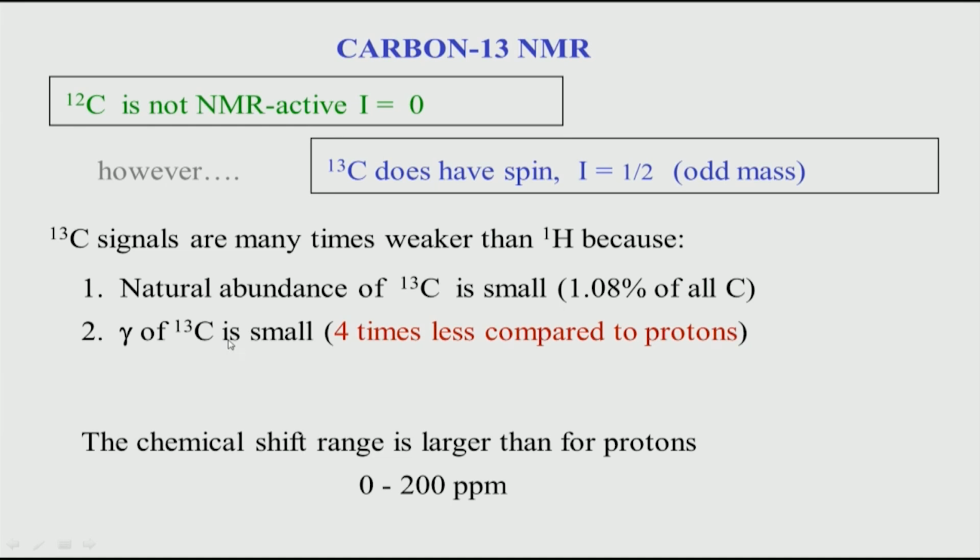But there is one more factor which makes carbon 13 even more insensitive, which is when we detect carbon. So normally what happens is in 1D NMR we apply the pulse to proton and we detect the proton signal. That is the standard 1D NMR, proton NMR which we have seen up to now. But if you do the same thing with carbon, we are going to excite or apply a pulse on carbon and also detect carbon. So during detection, again the sensitivity of the gamma comes into picture, and therefore there are twice it has a problem. First, when you excite, the sensitivity is already low because the population difference is low, but when you detect carbon, then also again it is low because of this low gamma. So basically it is like a square, I mean 2 times gamma comes into picture.